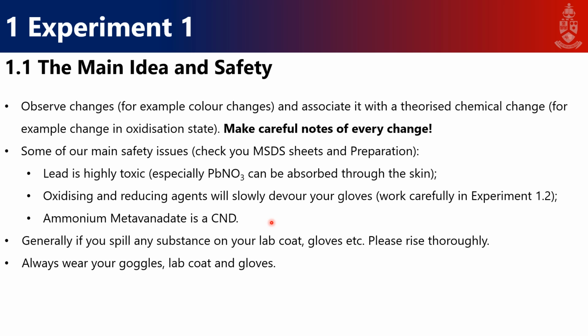Always work with any chemical in the fume hood. Do not weigh anything outside of the fume hoods. Do not work with any volatile liquids outside of the fume hood. Measure everything in our dispensing fume hoods. And if you have to transfer something between fume hoods, ensure that you cover it with a watch glass or at least with your glove, so that if spillage or volatilization happens, there is some coverage.